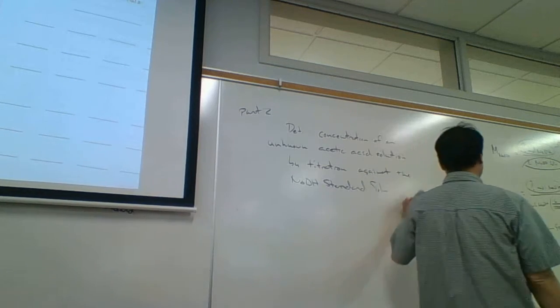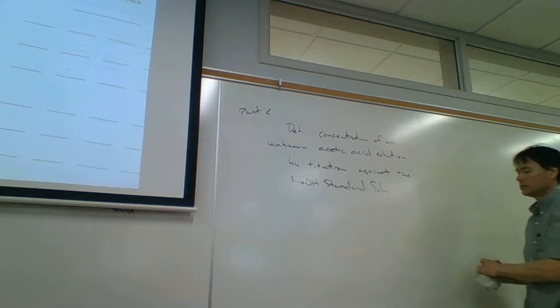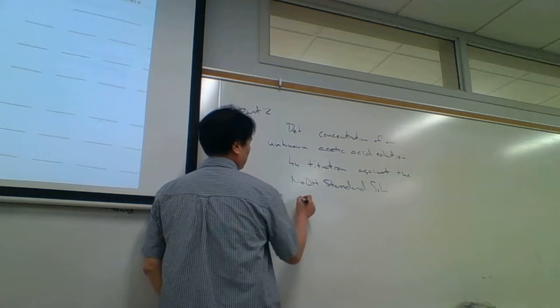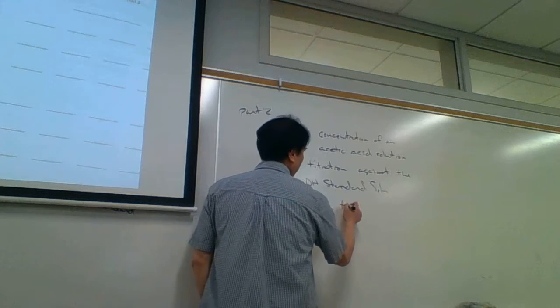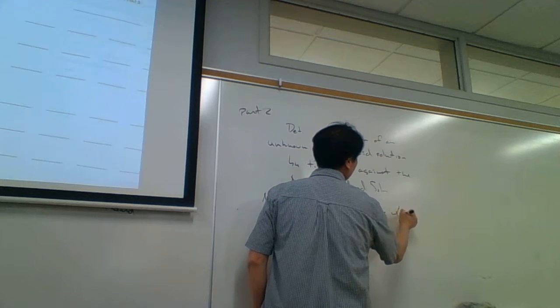All right, so we're going to do the same thing here. We need 3 good trials that agree within 0.5%.